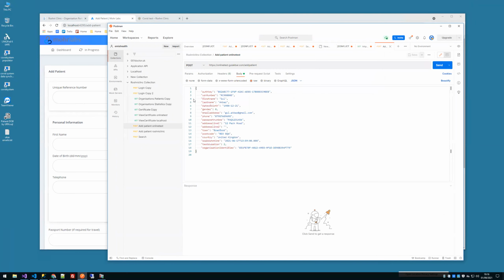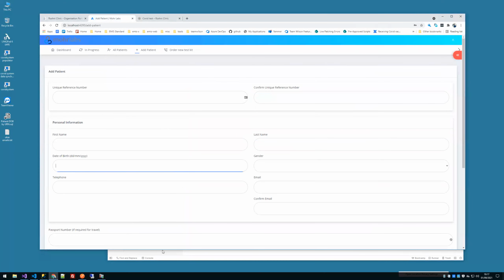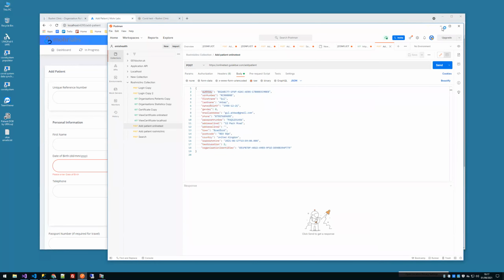So ultimately, this is what's coming through for adding a patient, as long as you're passing information through to us with a specific authorization key, so we know it's genuinely you guys. That will land into the system, no problem with those details, whether it's a website, adding it in, or an API call. So obviously, we can work with that. We can work with you on that.